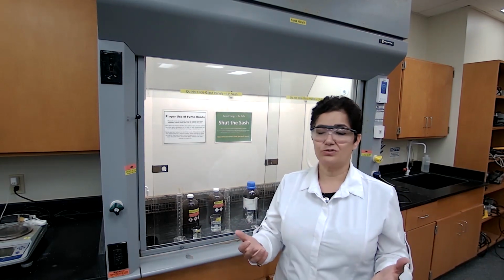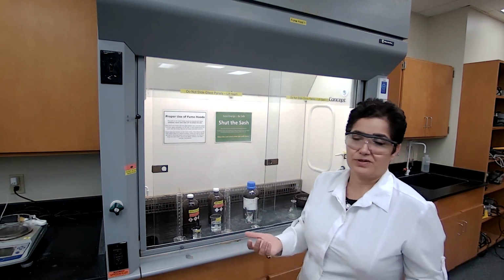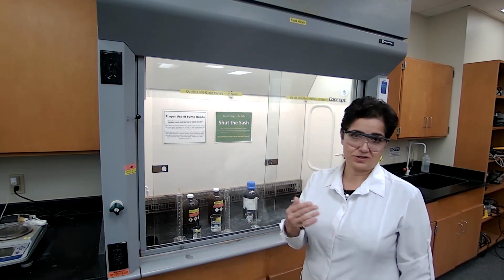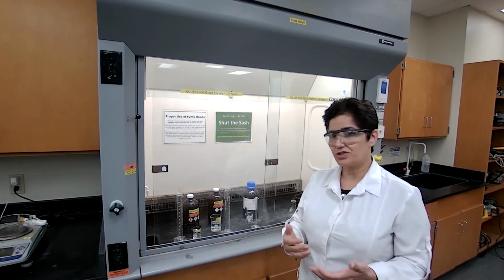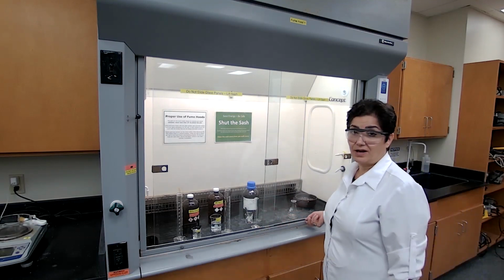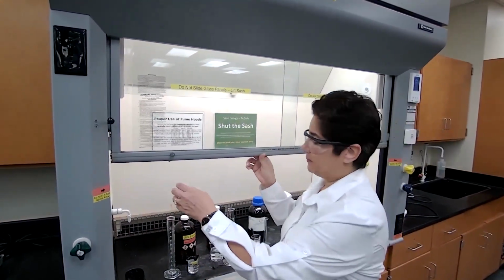We have other ways to do that too. We can purify it right away by distillation, probably a vacuum distillation, and just isolate the benzaldehyde from the benzoic acid. Or in this case, based on this procedure, I'm just using an extra amount of benzaldehyde to make sure we have enough. I'm going to make the measurements following the procedure.